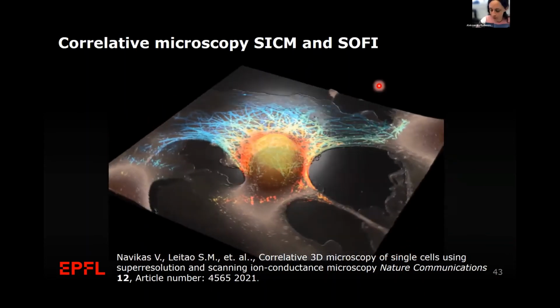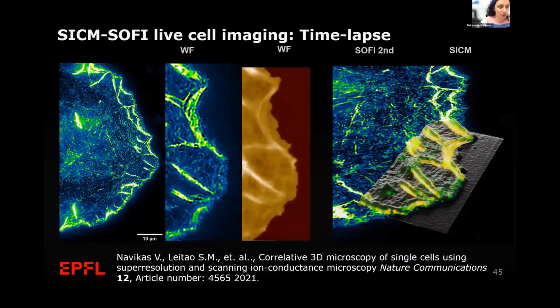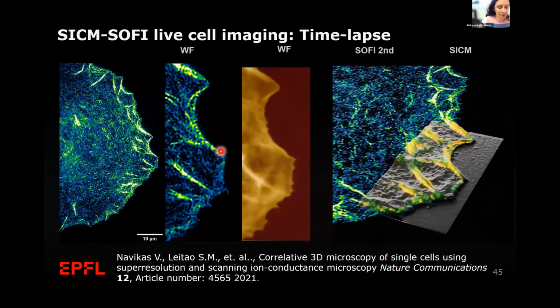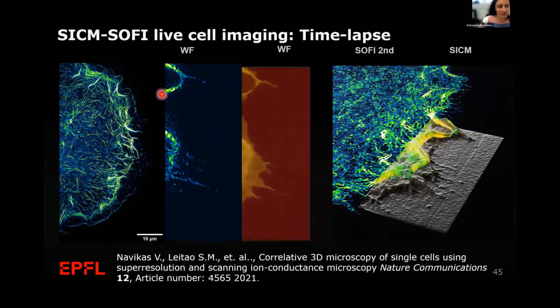as we normally do. But coming back to the platform where we can do everything at the same time, so this is nice because we can perform simultaneously also SOFI, so fluorescence imaging, and also we are quite big.